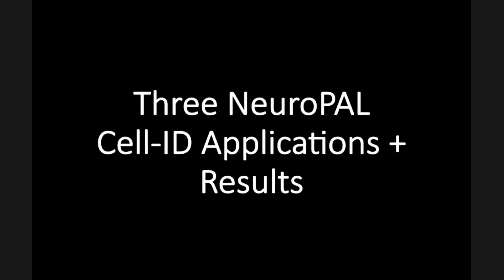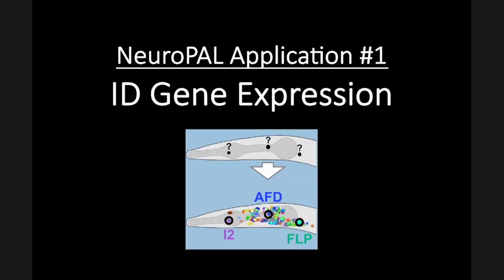Okay, now that you understand the method, I want to tell you about 3 NeuroPAL cell ID applications and the exciting results that came from them. The first one is identifying gene expression.